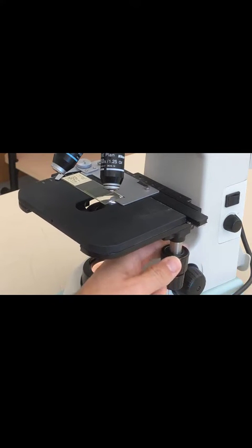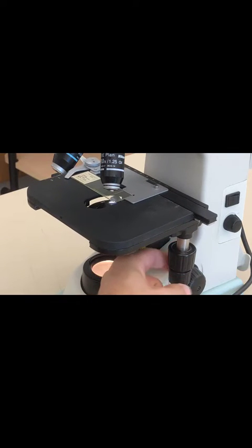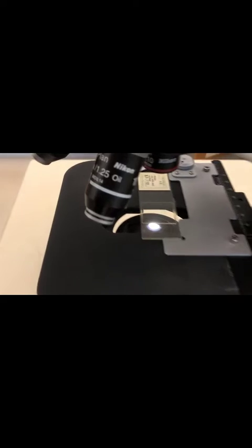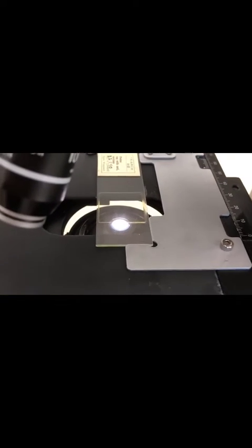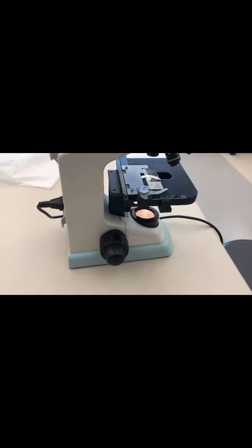You're going to use these two dials. You turn the top dial. Notice how the slide's moving towards you, away from you. And the bottom dial's left and right. You want the specimen to be right in the light's path. Otherwise, you're not going to see it when you try to focus the microscope.